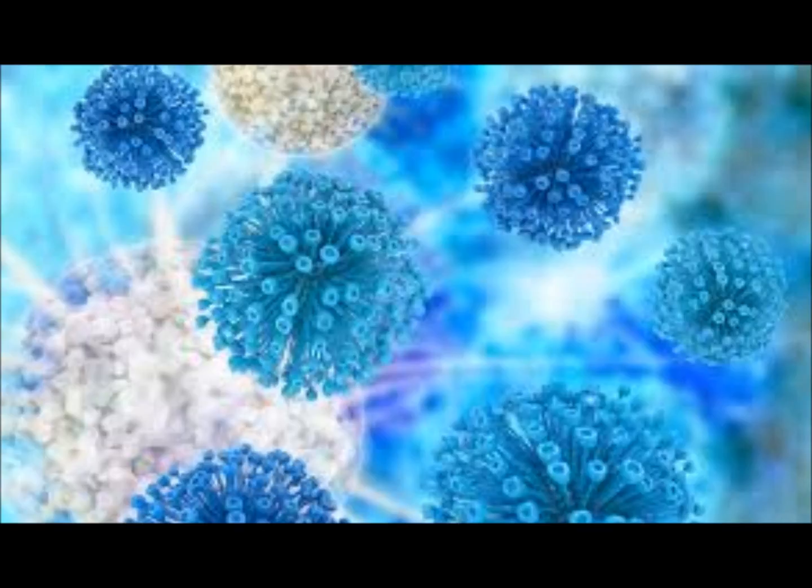Don't open your plates, thinking, I got 10 blood plates I want to plate, so I'm just going to open all the lids to make it better for me. But then that whole time, by the time you got to plate 10, it's been open to the environment. And you can get bacteria that way too. So always be conscious of aseptic technique. You only want to grow what's infective in that patient's body fluid or in that throat or that urine. You don't want it impacted by your poor technique. Okay? Or reusing a loop on another culture by mistake because you didn't throw it away.